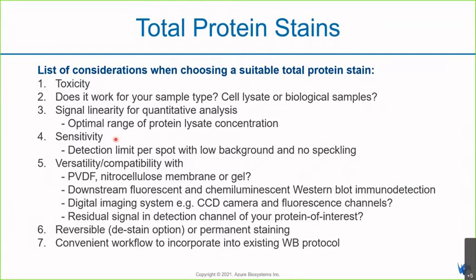Okay, next is of course sensitivity. It must be sensitive as well. It should allow you to detect the spot and the pixel, but still give you a very low background and no speckling in the image.